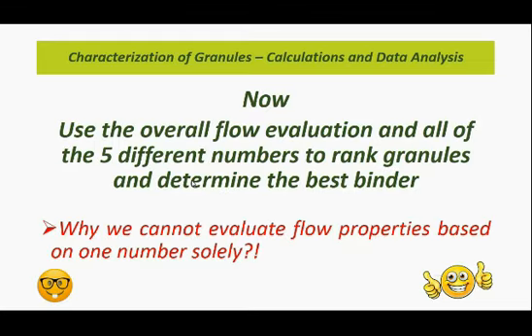Those particles, or granules in our case, with moisture content the closest value to that of lactose will indicate better flowability. Remember, we assumed that the original moisture content in lactose is the optimum moisture content that will not affect the flow in a negative way. Then these granules can be evaluated as better than others.